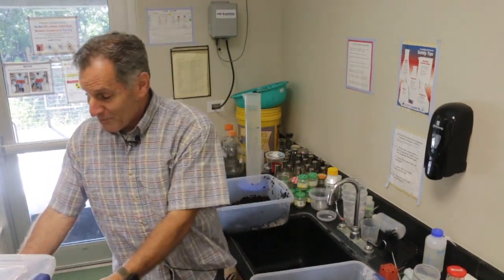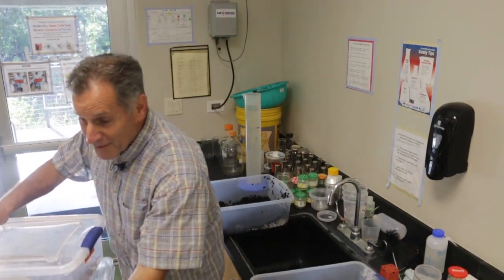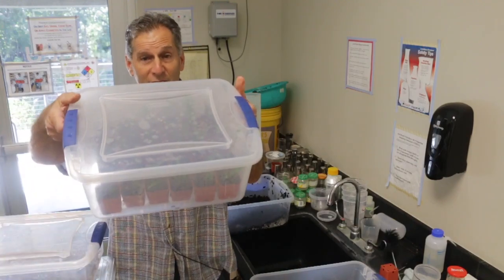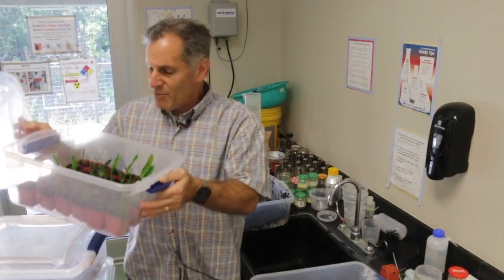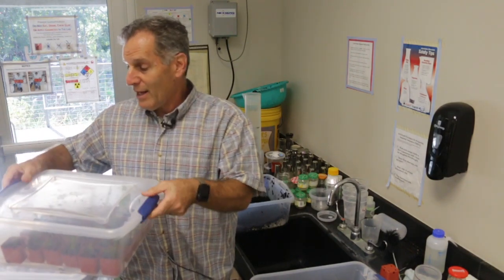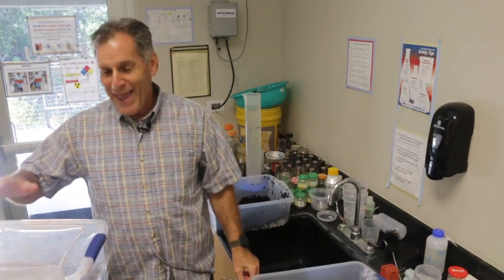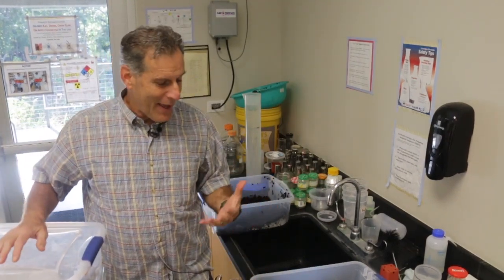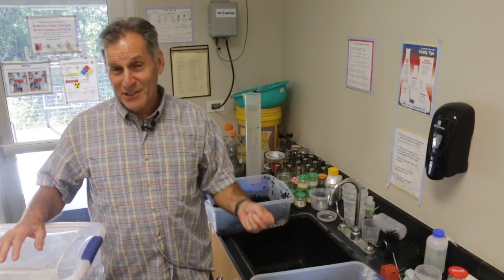I've deflasked 5 bins today. Not really going to take a look too much at them, but there's a lot of plants been on it, and I thought I would just do one more and share with you how I'm doing these things and what the little bit of difference is.